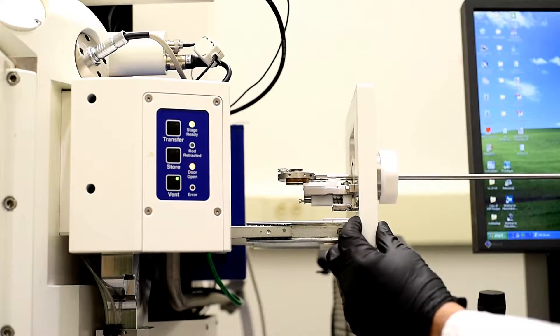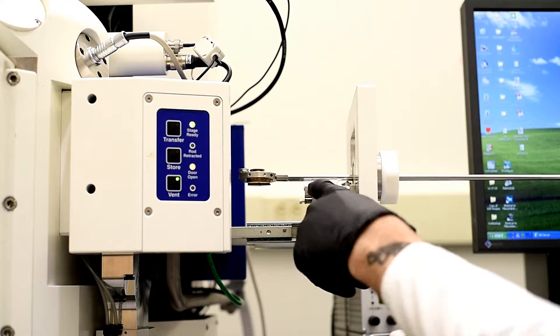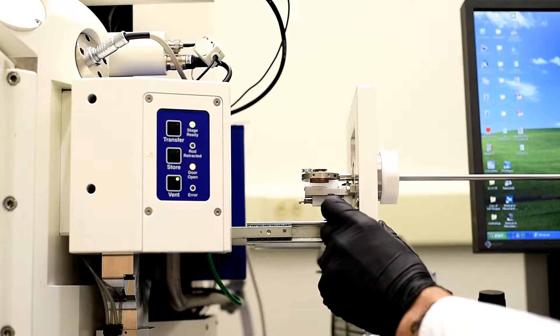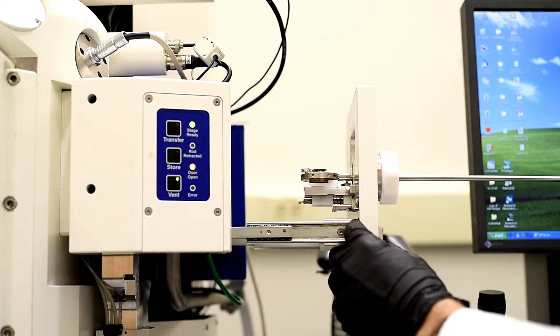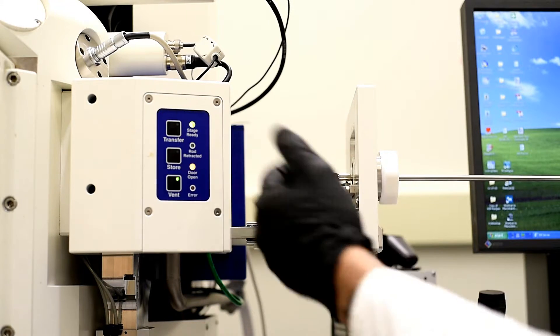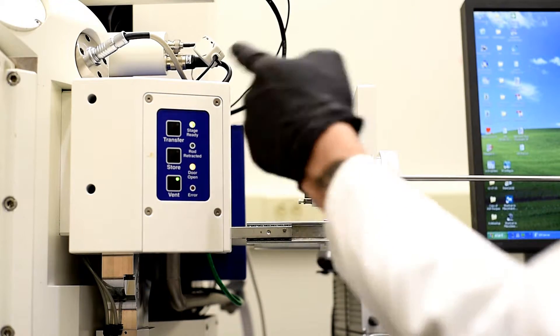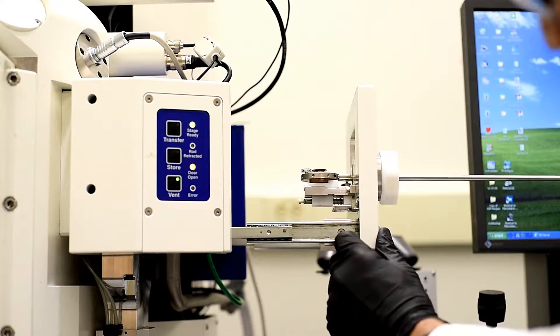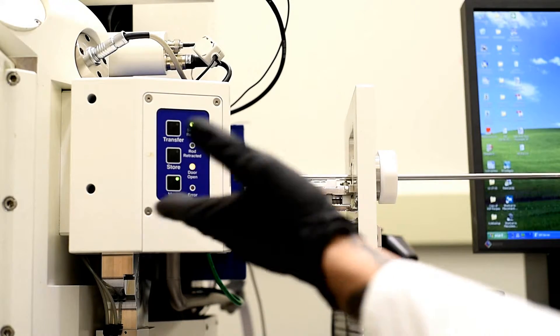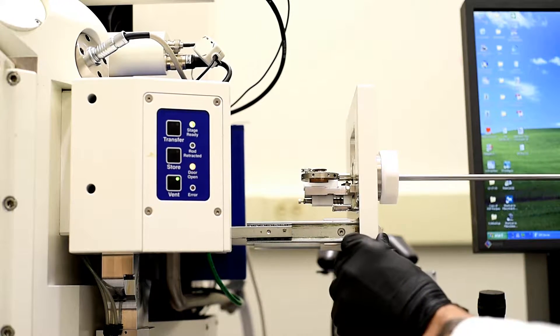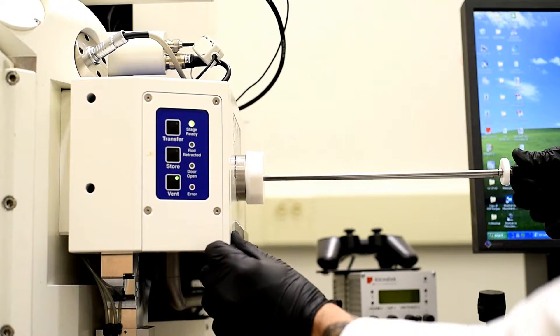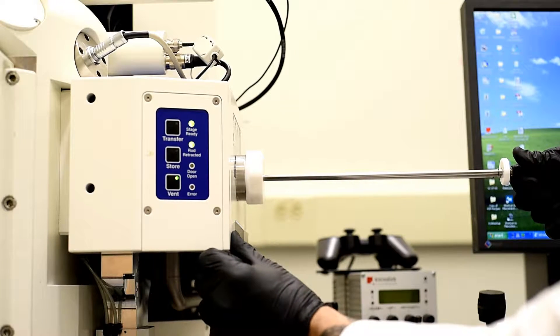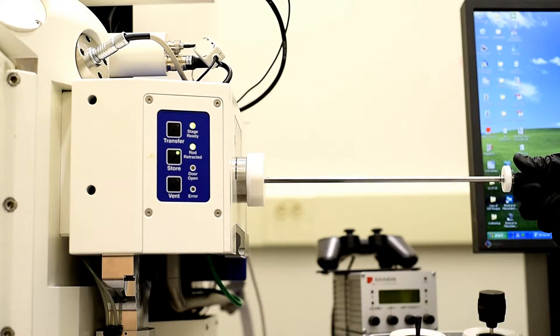Now we can move it on and off of the island. So what we're going to do once we get this back into the chamber, we're actually going to open a door and slide this off of this little island onto the other one. So now we'll pull it back in place, we'll shut the door, and we'll hit store.